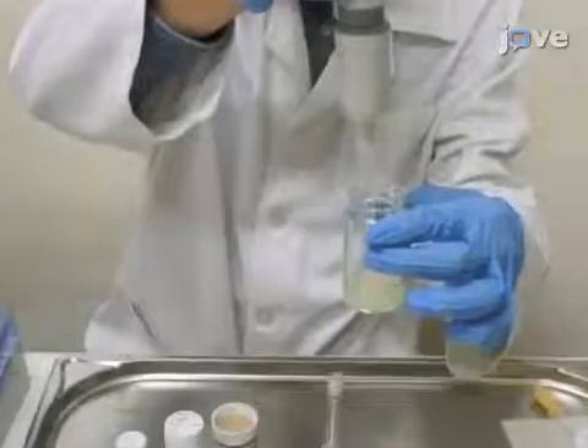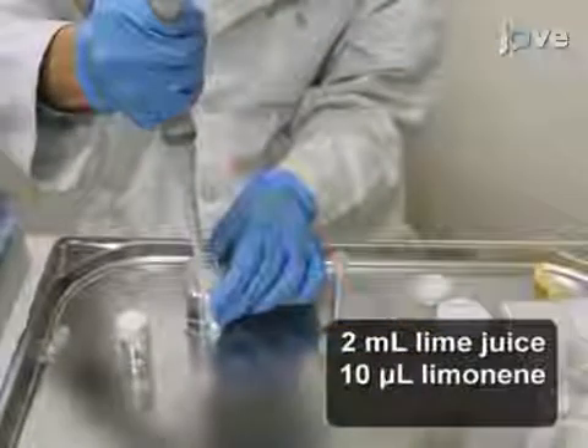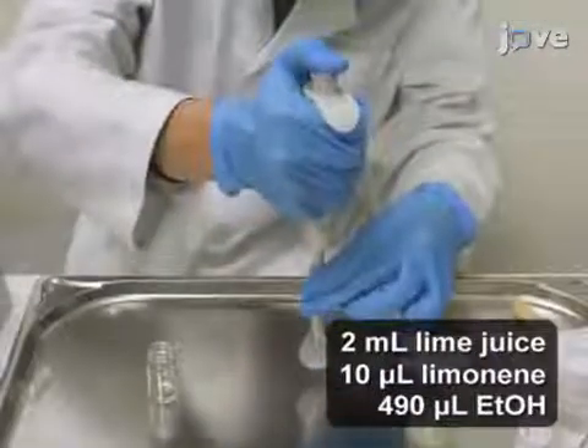Now, prepare a spiked sample by mixing 2 milliliters of lime juice, 10 microliters of the limonene stock solution, and 490 microliters of ethanol. Add LC-MS grade water to a final volume of 10 milliliters and mix.